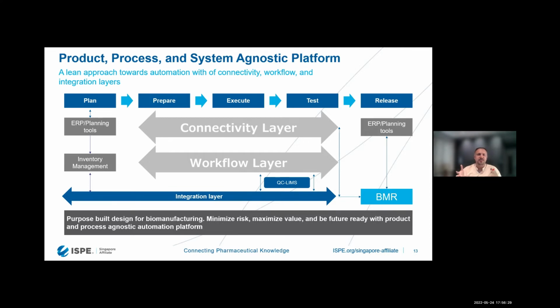Your batch would run with the bioreactors, with the TFF systems, with your chrom systems, and then comes up the final purified product. It goes through the fill and finish. So this is where the magic happens, when you prepare, when you execute, when you do the testing, and then come up with the batch release. And this is also where the demand for the entire integration is today.